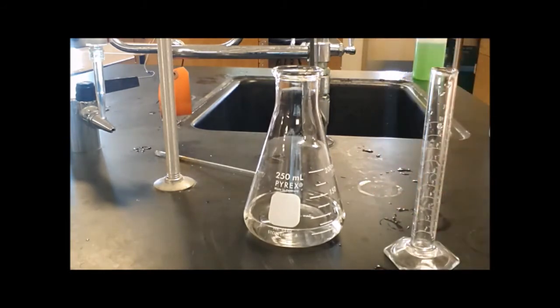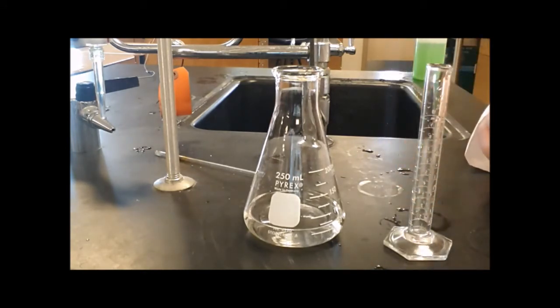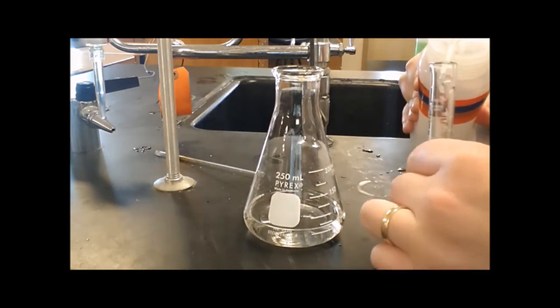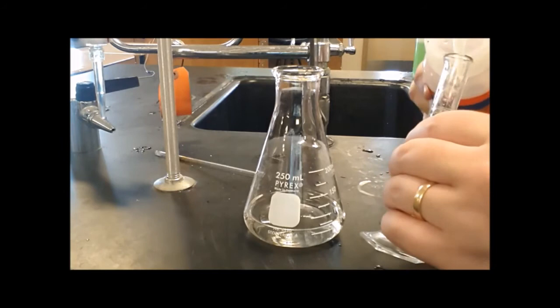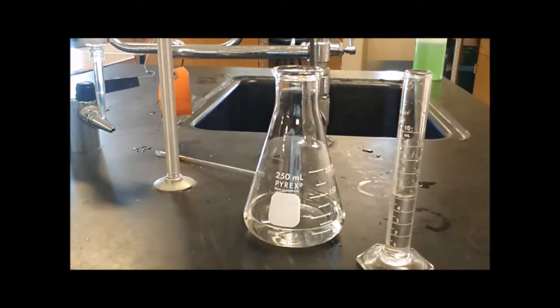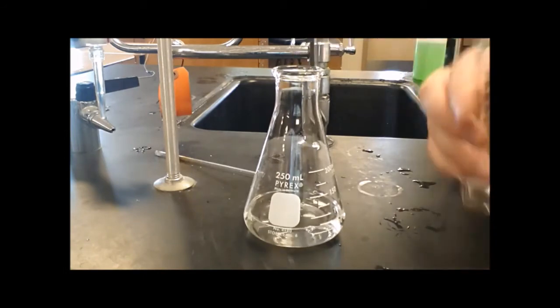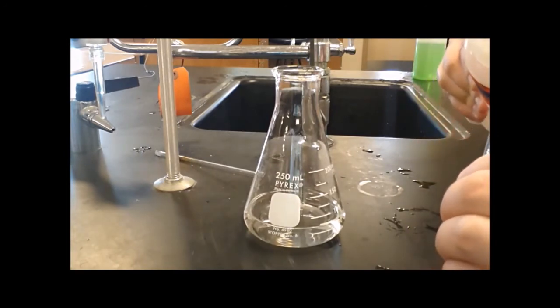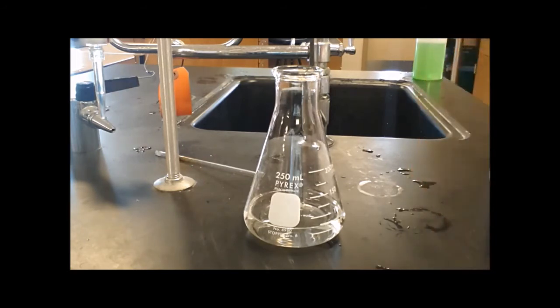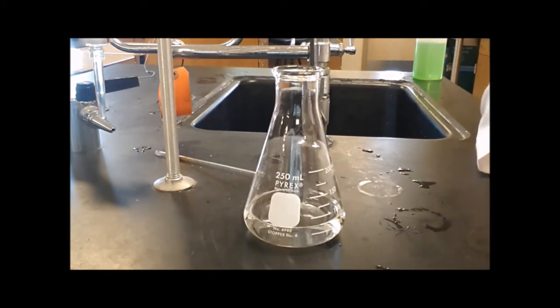So I dumped my acid into my flask. However, you'll notice that there's still little tiny drops in there. Those drops represent moles of acid that we need to titrate. In order to get all of those drops of acid out, we're going to wash down the sides of the graduated cylinder with deionized water. I can use as much deionized water as I want, because adding more deionized water at this point will not affect the number of moles of acid that are being titrated. Because that's key. Titration is a stoichiometry problem, where the moles of acid are equivalent to the moles of base. So we are going to react all of the moles of acid with our base, and then we will know exactly how many moles of the unknown thing there were.